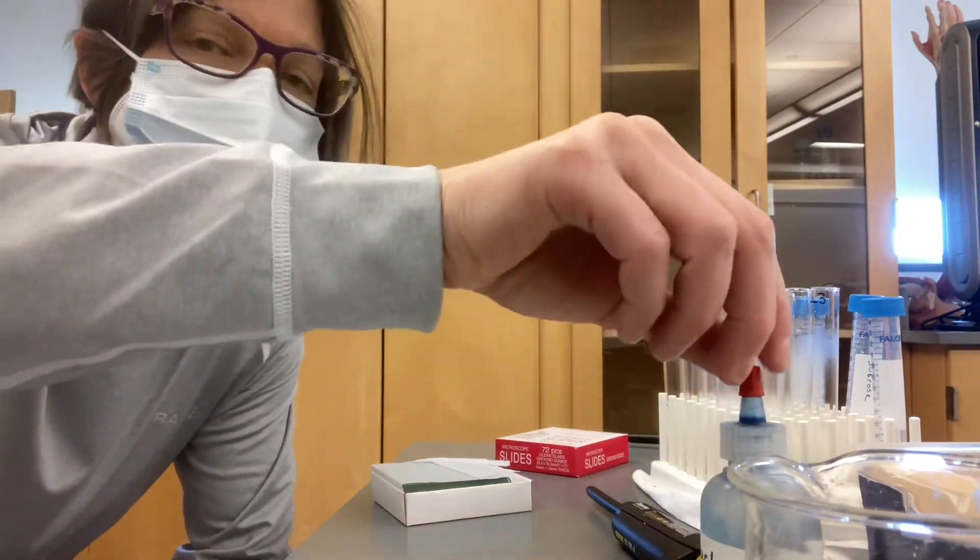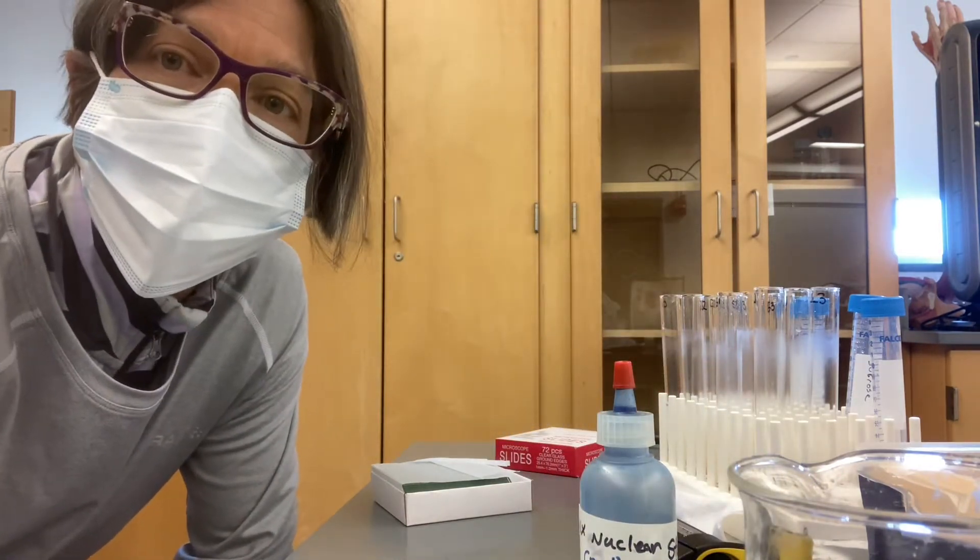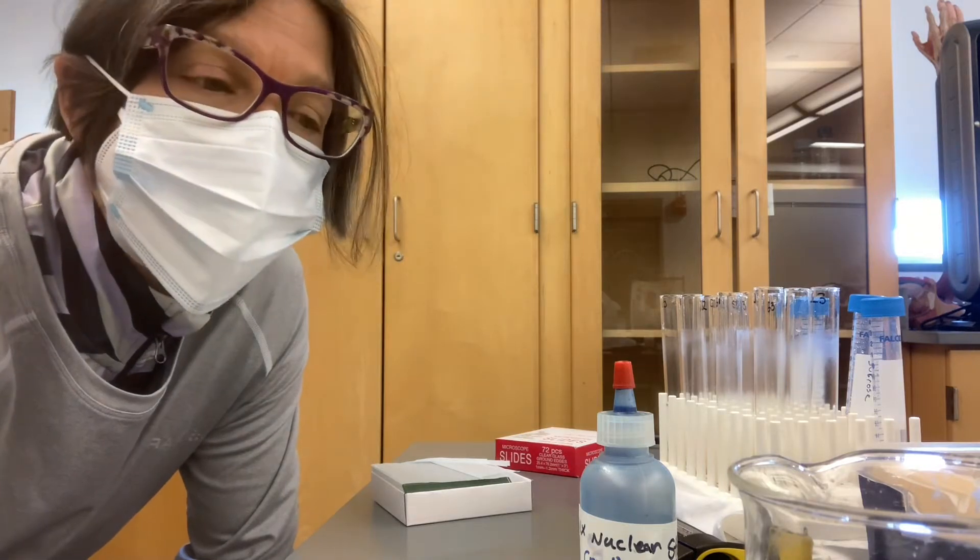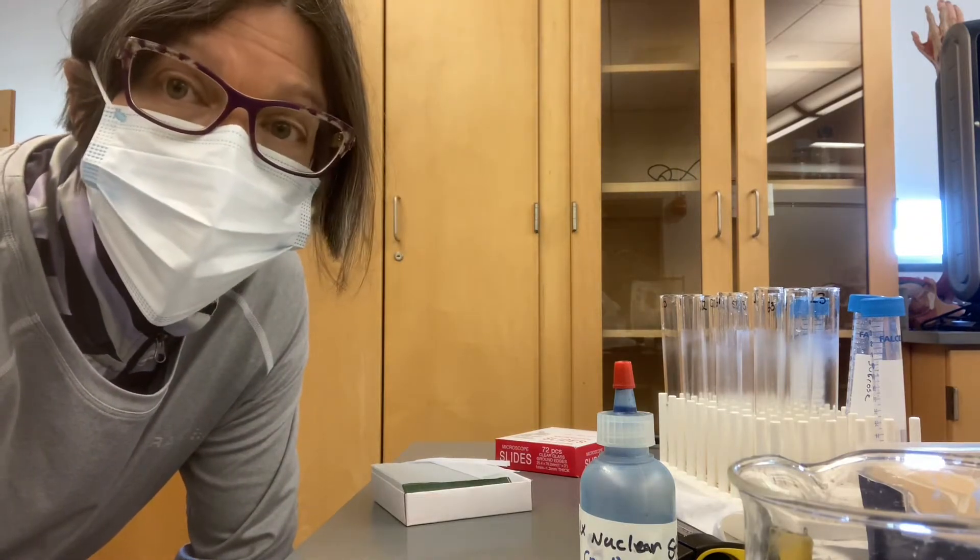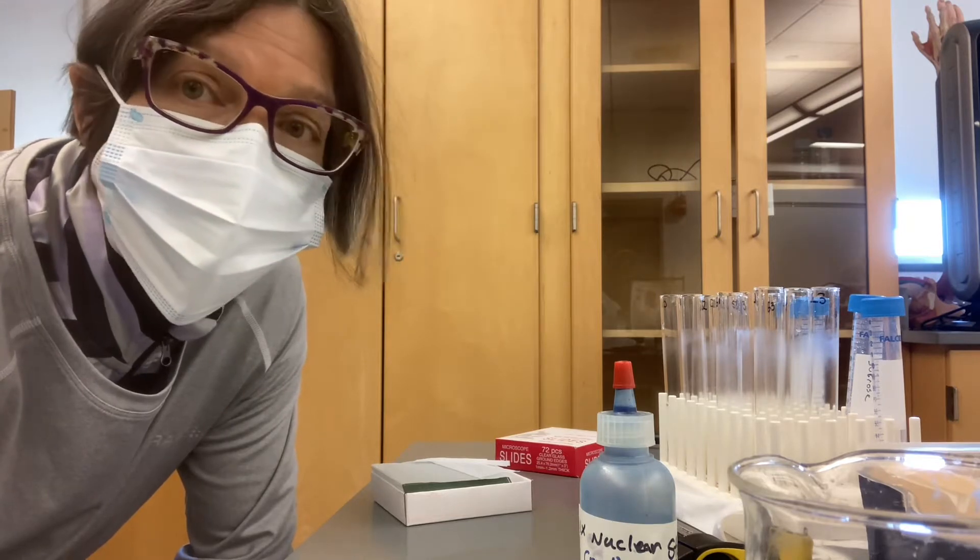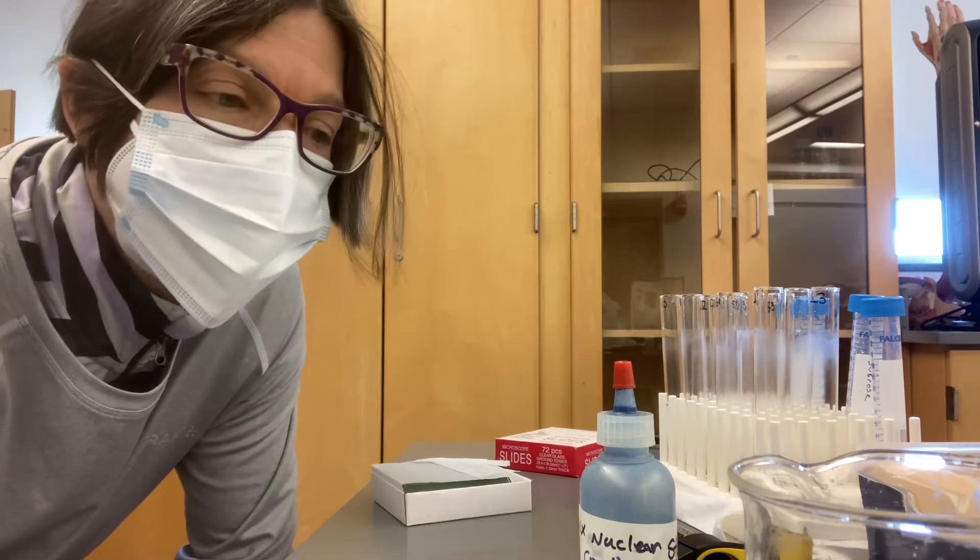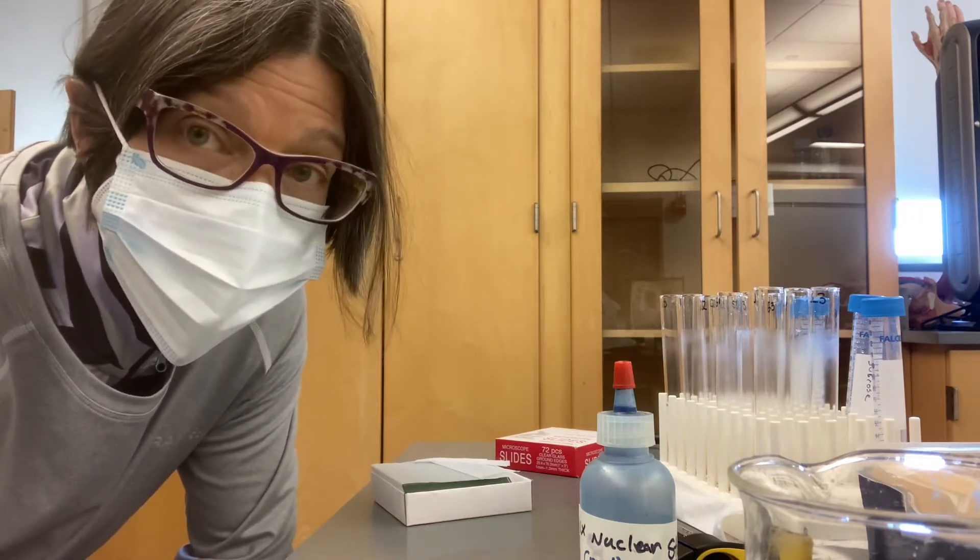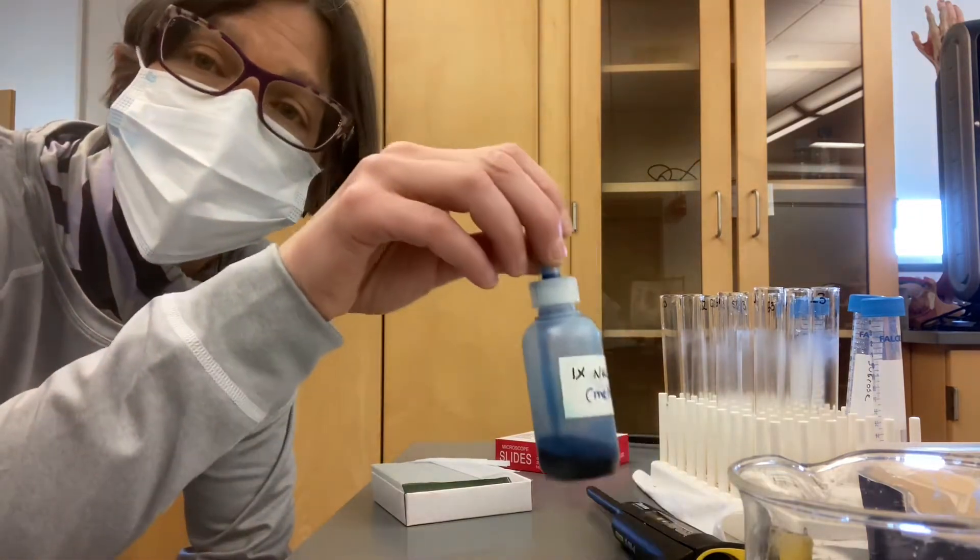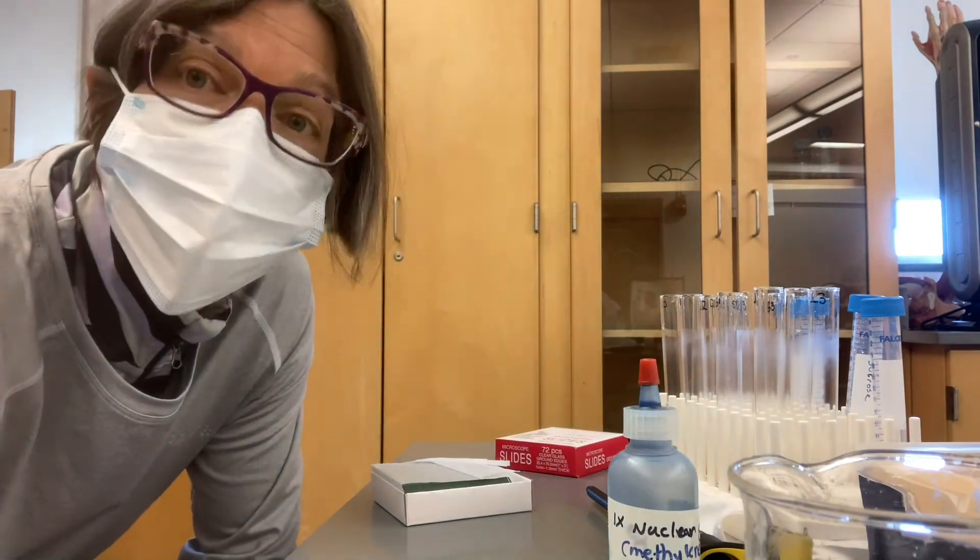And what this dye does is the dye can exist in two forms, just like a coenzyme. So it can exist as a reduced molecule carrying extra electrons or it can exist as an oxidized molecule lacking these extra electrons. When it is in the oxidized form, the color is blue. When it is in the reduced form, it's clear or colorless.